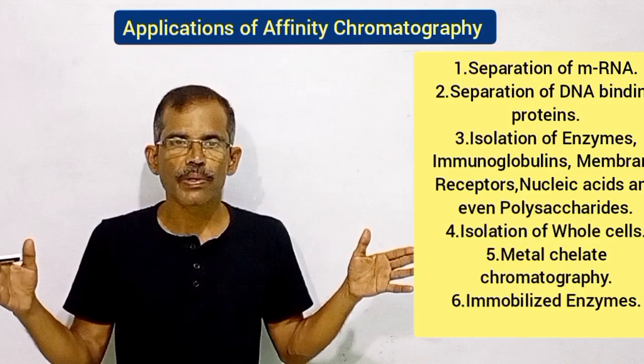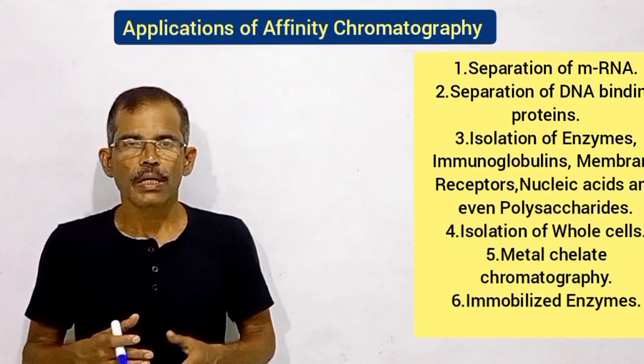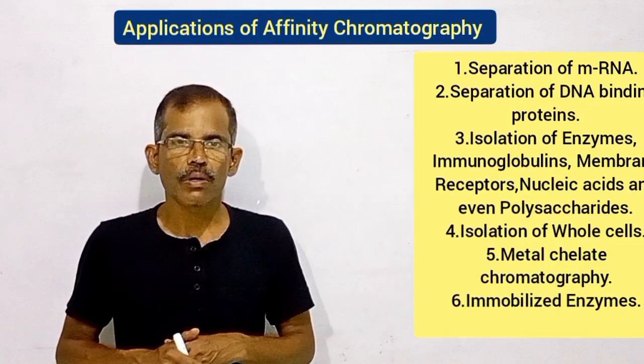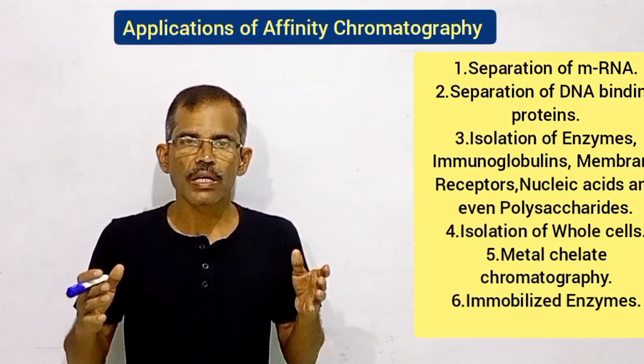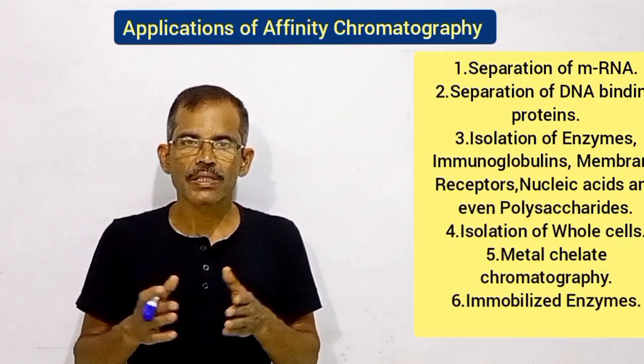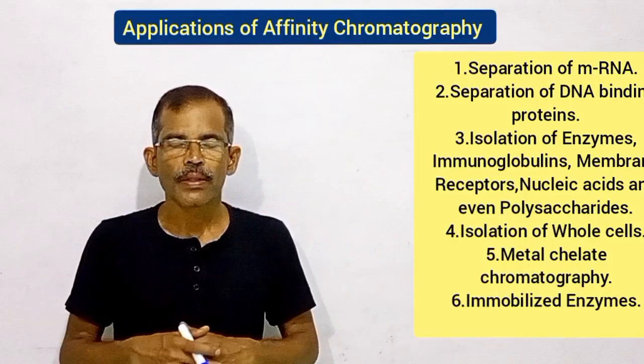Affinity chromatography has many applications. Number one, in order to study gene expression, molecular biologists frequently have to isolate messenger RNA from a sample containing different types of RNA.